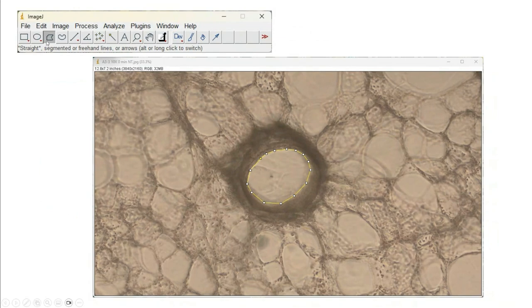That's using this tool here. You'll just go File, open your image of your slice, and then click on this selection tool here, and then click around the interior of the slice, and then click Analyze, click Measure, and it will give you a value of the two-dimensional surface area of the lumen itself.